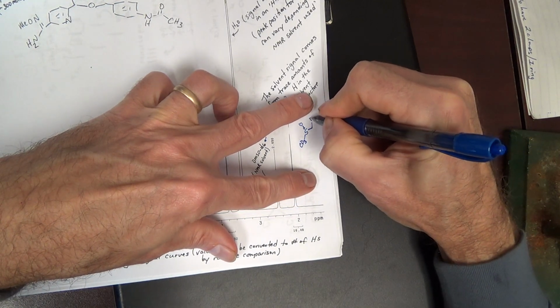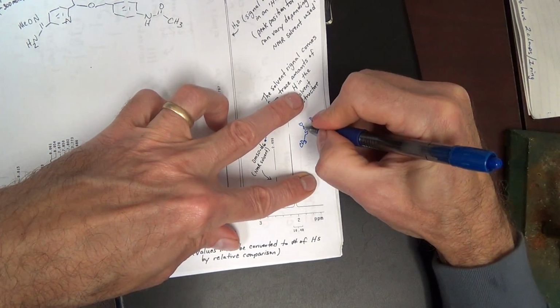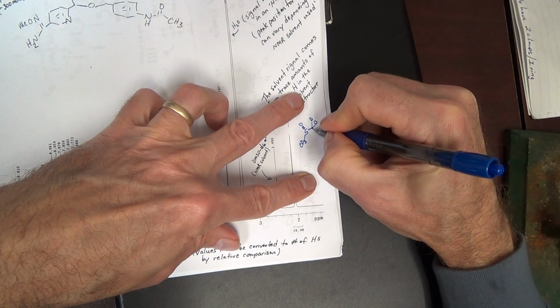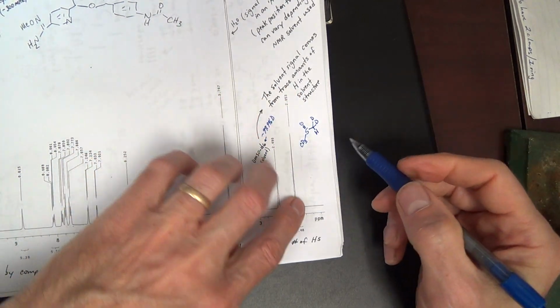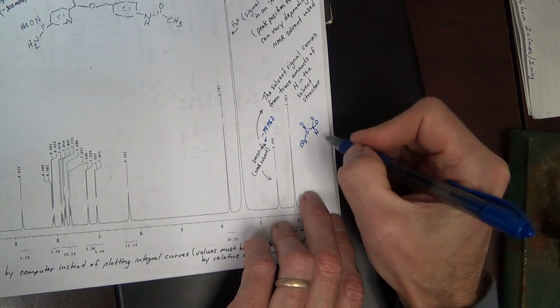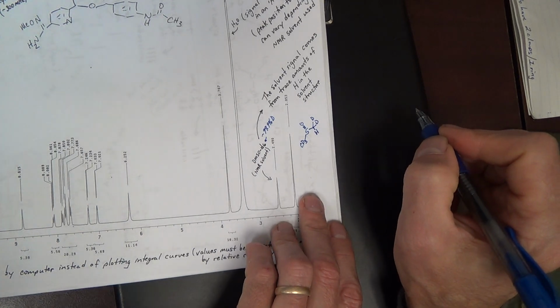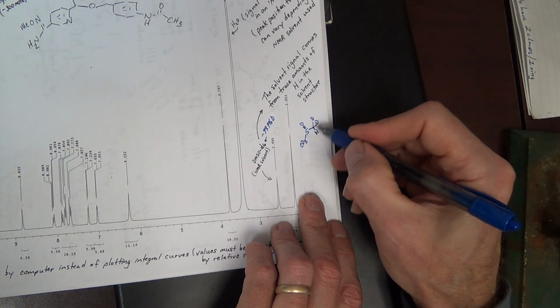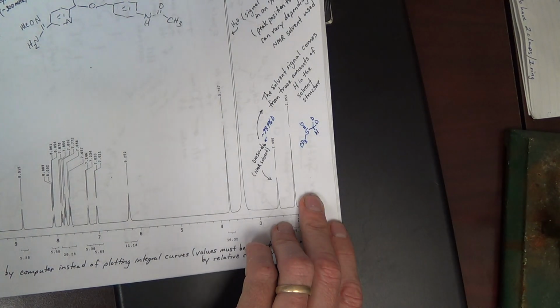You probably have some molecules where there is only 5 deuteriums, and thus it has 1 H on it. Or you could have a molecule that has 4 deuteriums and maybe 2 H's.